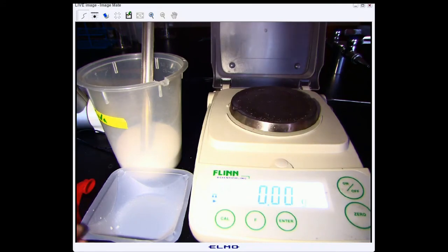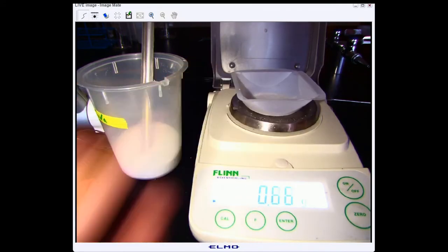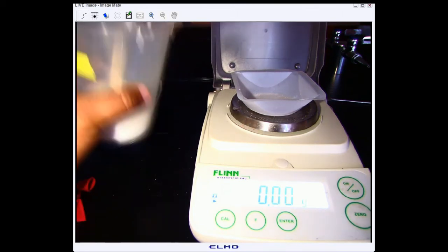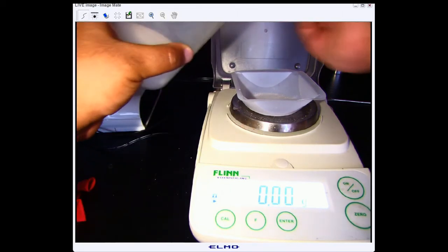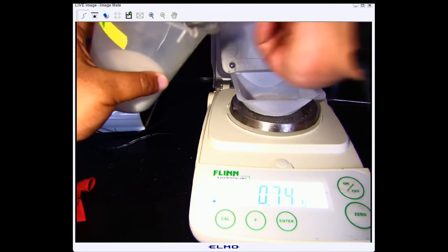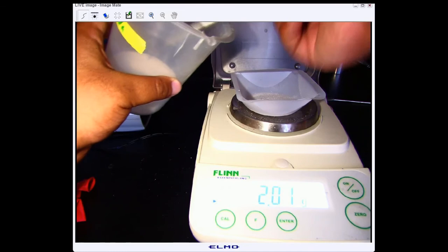To start, we're going to place our wayboat on the scale and zero that. Now we're going to carefully weigh out approximately two and a half grams of baking soda, and I'll show you the baking soda real quick so you can make observations about that.